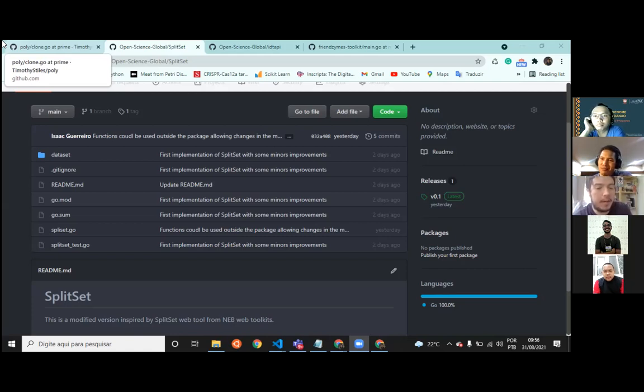So for now, just to share one piece of information. I'm trying to work right now with the protocols that OpenTron will run. So I'm trying to create standardized protocols for OpenTron. And I'm talking with Keone. Keone is contracted by OpenTron to make these protocols for them, actually. And what he said to me is that I have to run a lot of experiments to troubleshoot and see if the experiment actually works fine.